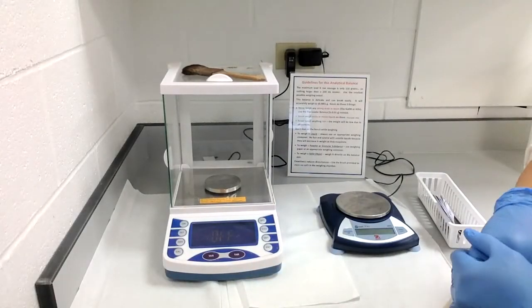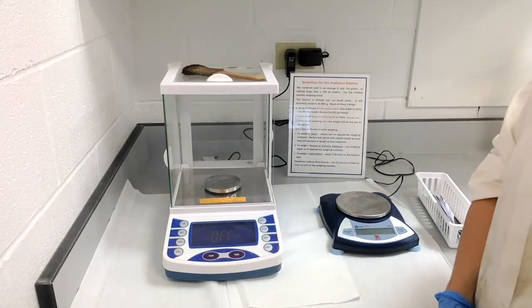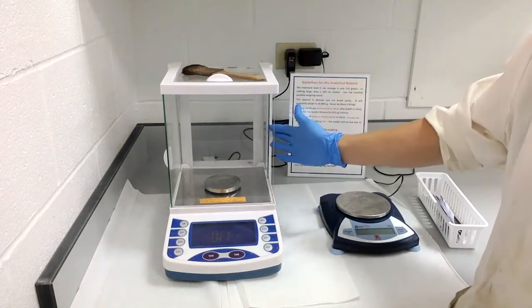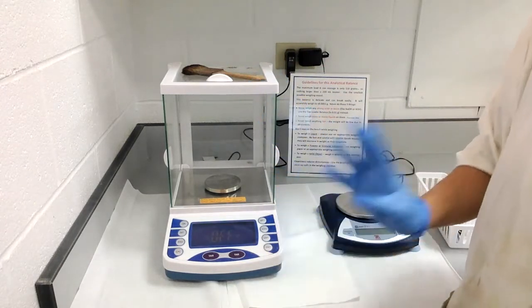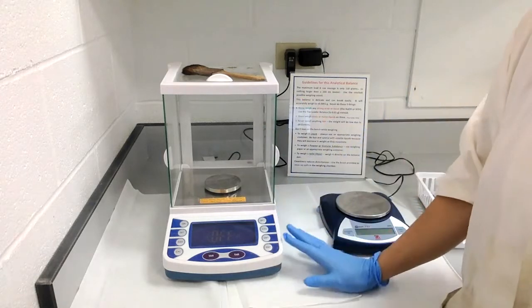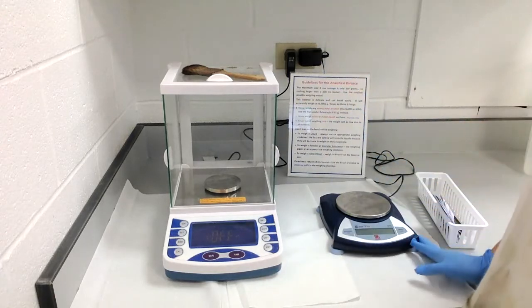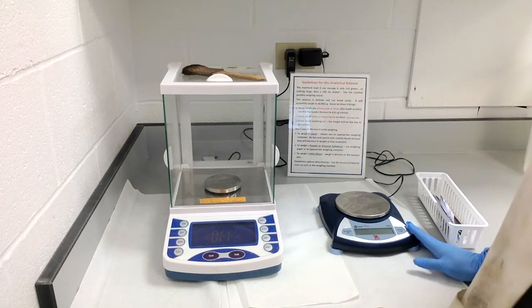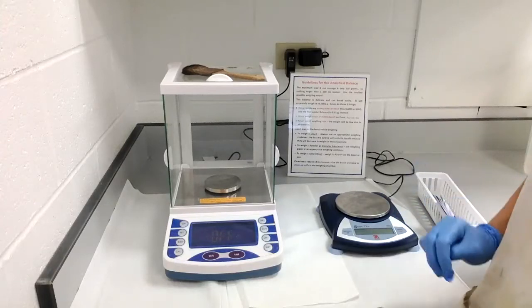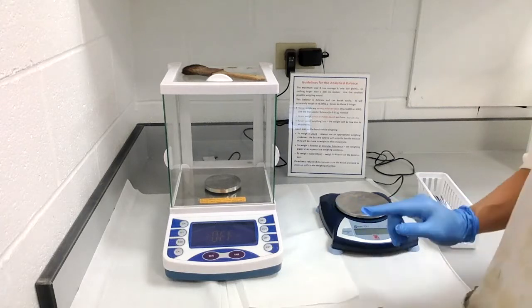In this video we're going to talk about the two scales you'll be using this semester in General Chemistry Lab. This scale, which looks a little more futuristic, is the analytical balance, and it reads to four decimal places, so it is the more accurate of the two. This scale is the top loading balance, which reads to either one or two decimal places — for our lab, most will read to two decimal places — making it the lesser accurate of the two.